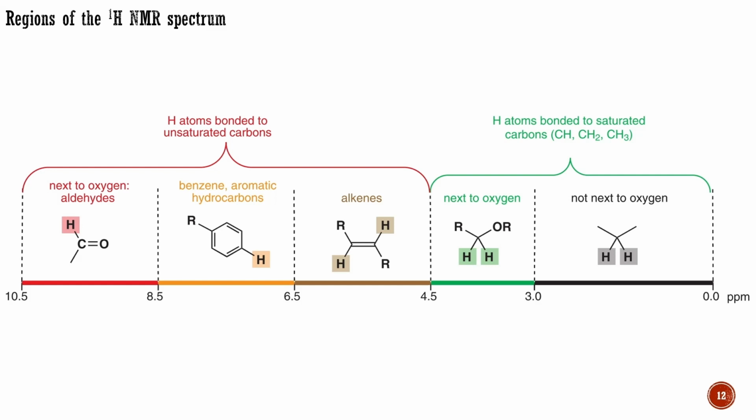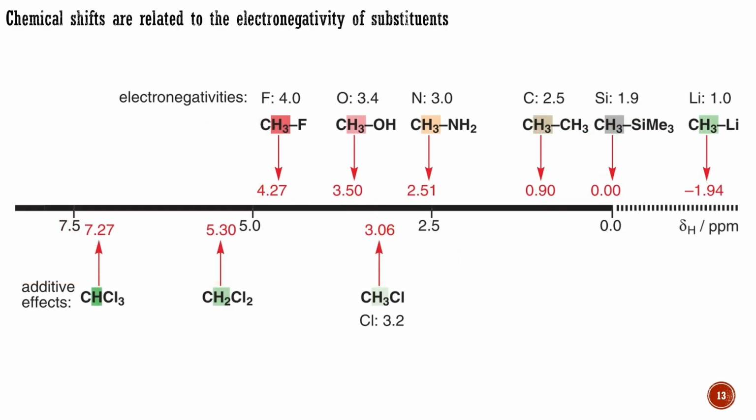To help you achieve this understanding, we now need to examine the classes of proton in more detail and examine the reasons for their particular shifts. It is important that you grasp these reasons. In this module, you will see a lot of numbers, chemical shifts, and differences in chemical shifts. I need these to show that the ideas behind proton NMR are securely based in fact. You do not need to learn these numbers. Comprehensive tables will be provided in the lectures of this module, which I hope you will find useful for reference while you are solving problems. We shall start with protons on saturated carbon atoms.